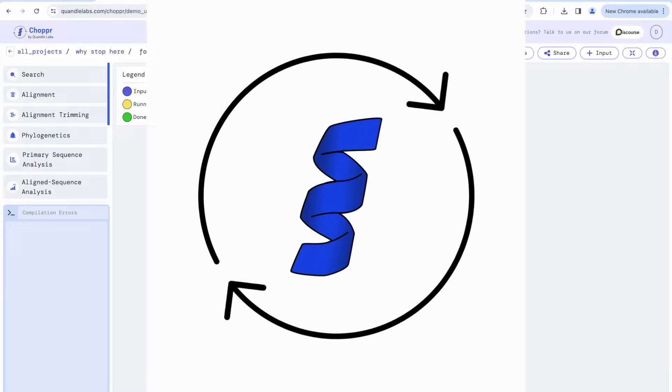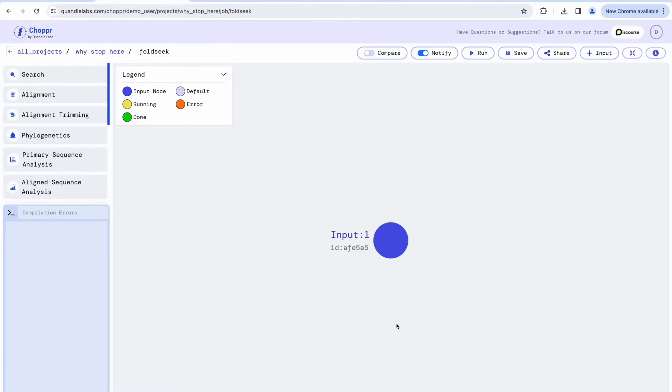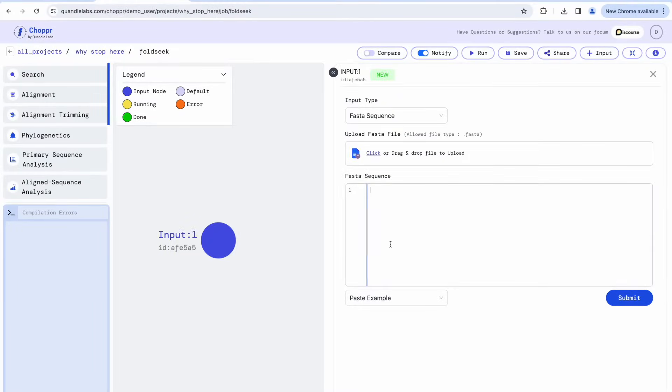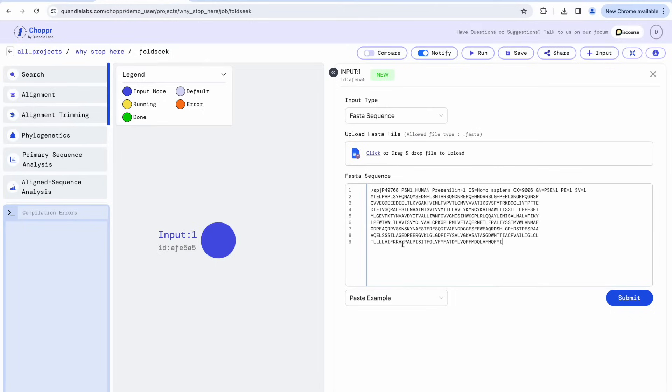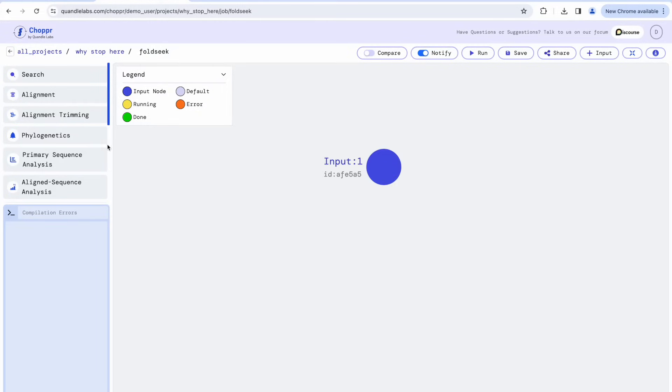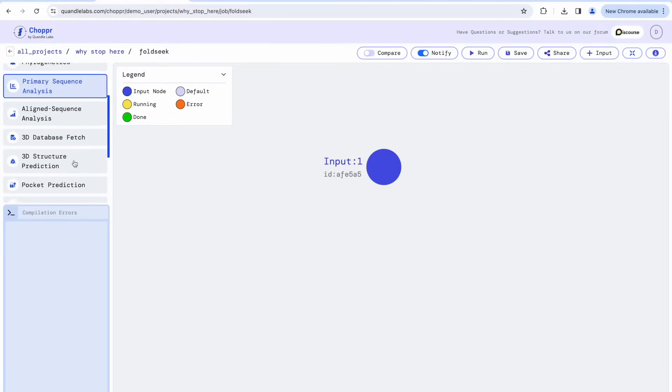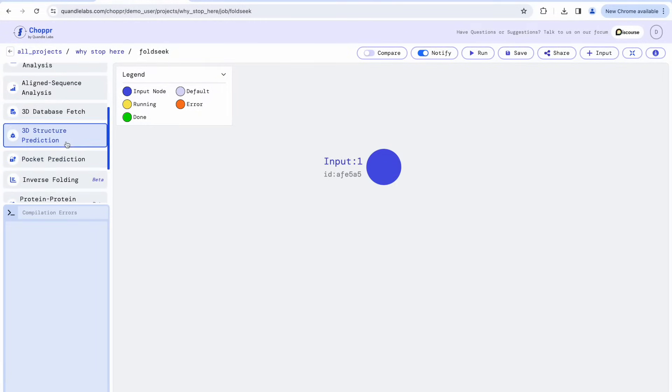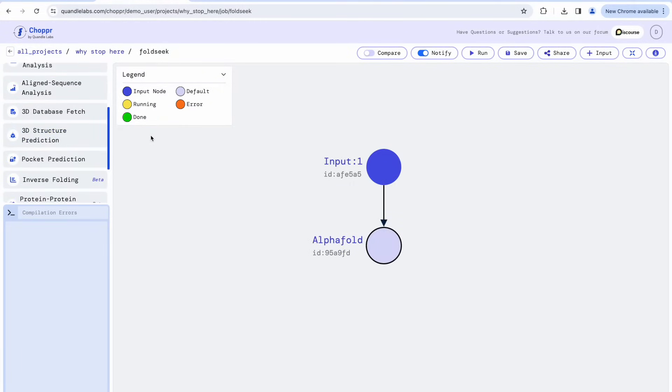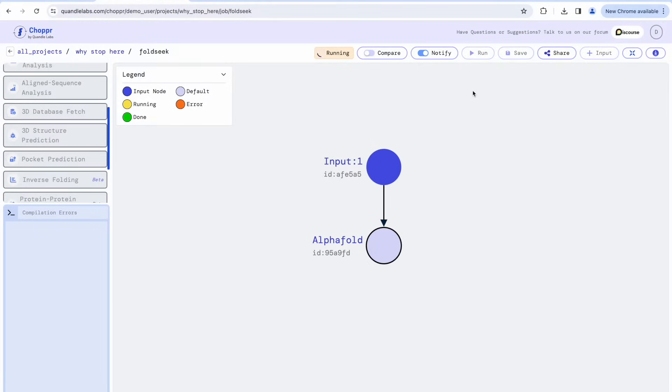Now let's check out how to use FoldSeq in Chopper. First, we will double-click on the input node and upload our protein sequence. Because FoldSeq requires a structure as input, we will first run AlphaFold to predict our protein's tertiary structure. Running AlphaFold is as simple as connecting it to the input node and clicking Run.